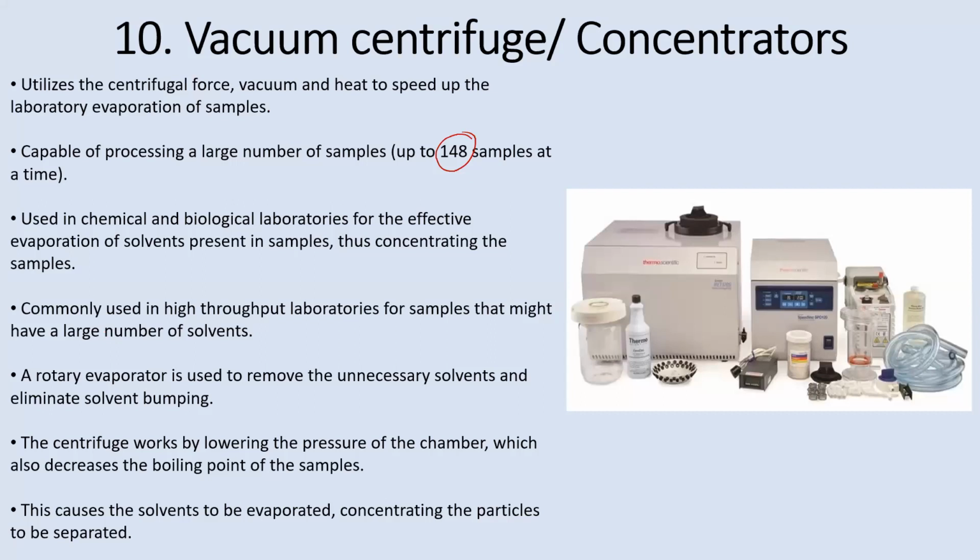As I said, it may be possible that you will have to add solvent at a certain step, and now removing that solvent becomes mandatory to proceed further. So how will you remove that solvent? Because if you heat it just in the open air, or you just leave it open, solvents evaporate also. If you're talking about alcohol, isopropyl alcohol and all those things, you know that at a certain temperature they evaporate. But at that temperature your biomolecule may degrade.